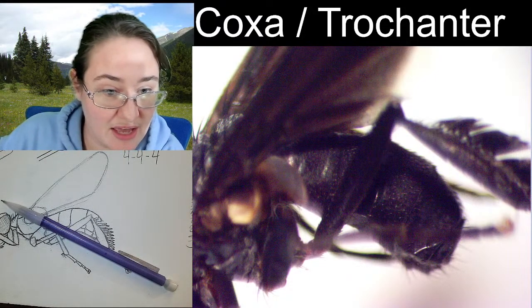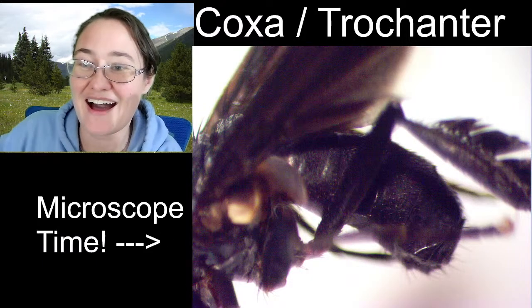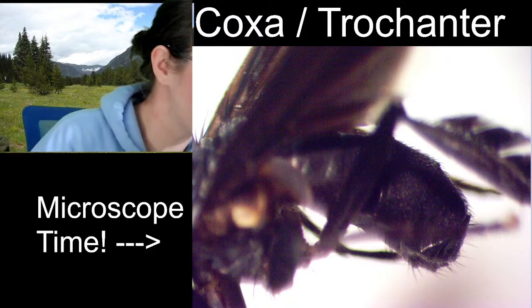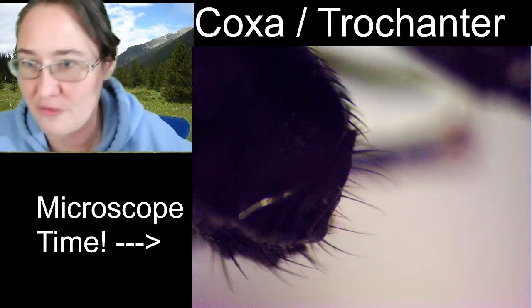I was looking at some photos of an especially fluffy winged moth earlier. Ah, so you were trying to make the distinction between the hairy regions on the wing versus the scaly regions on the wing. Sometimes some of the scales really turn into very hair-like.